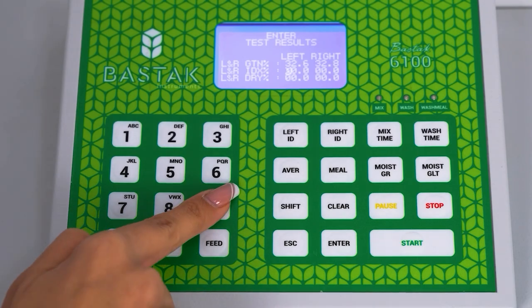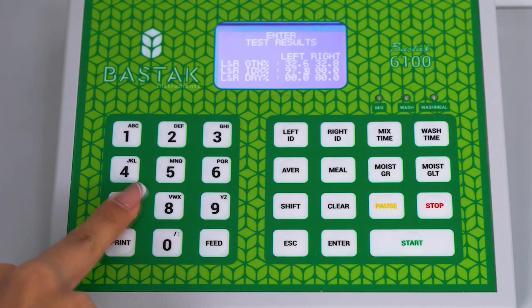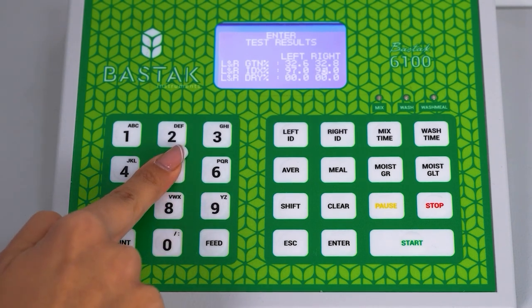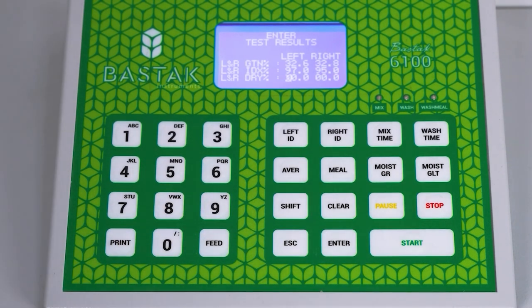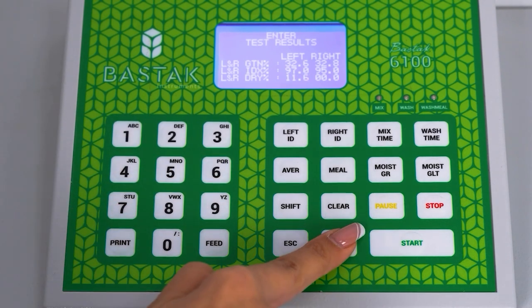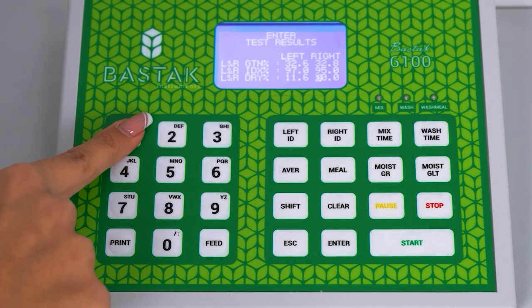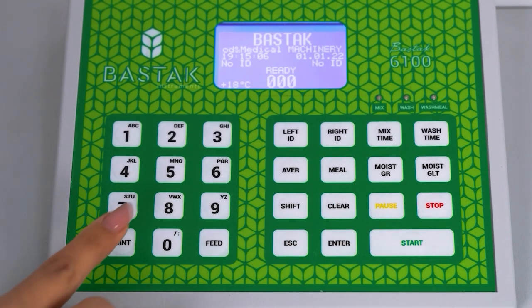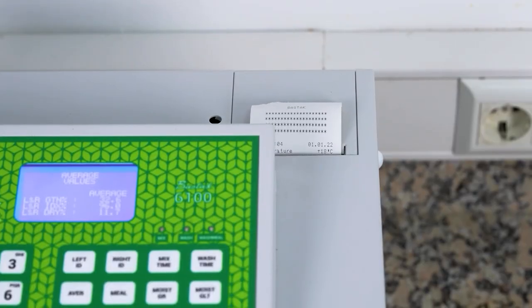Gluten index value 97 is entered on the left side of the device screen and saved. The gluten index value on the right is entered as 95 and saved. The dry gluten value on the left side of the device screen is entered as 11.6 and saved. The dry gluten value on the right is entered as 11.8 and saved. Then, by pressing the print button again, the printout is taken.